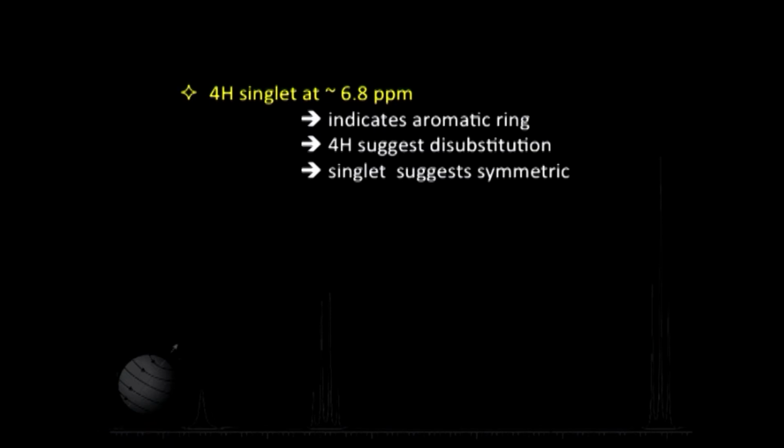The third information is that we have got a singlet here. Singlet suggests that this has to be symmetric in nature, because if it is not symmetric, I will not get a singlet, I will get more than 1 signal there.